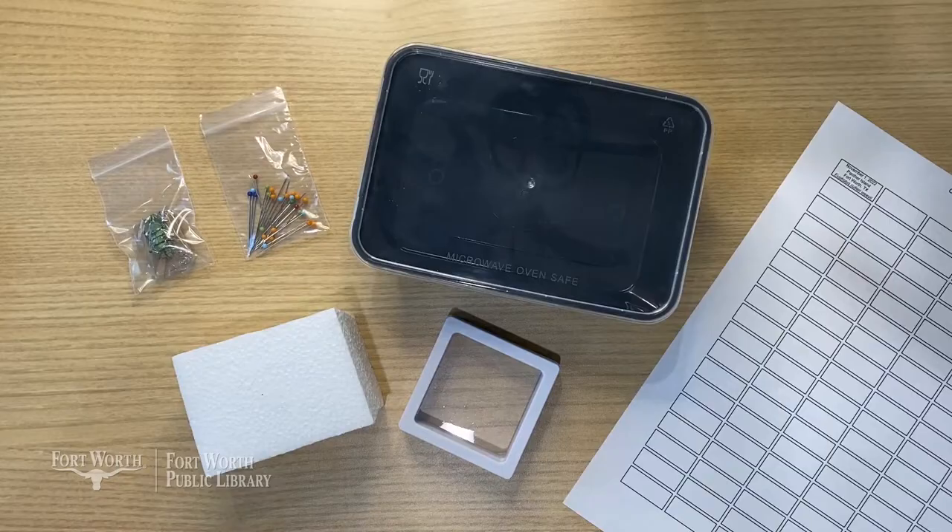Hey everybody, I'm Christina and I work for the Fort Worth Public Library. Today we're going to learn how to pin a beetle to display and study insects like an entomologist. Insects are fascinating and affect virtually all life on earth, even though they're widely unappreciated. This project will take a few days, but by the end you can use your beetle as art to display. You can pick up a Maker 101 kit for free from the Fort Worth Public Library this month.